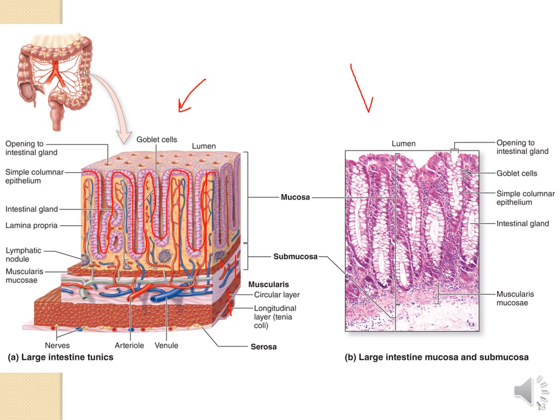And in this histological image, this is the epithelium. We can see most of the cells, these are the glands. Most of the cells are white or colorless. These are goblet cells. So as you can see, goblet cells are very numerous here. Most of the cells are actually goblet. And the more we go along the large intestine, the more abundant goblet cells become.